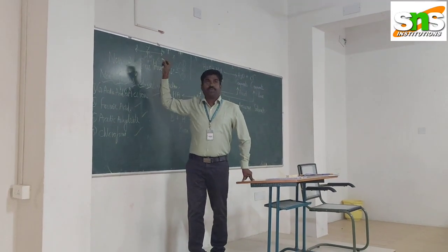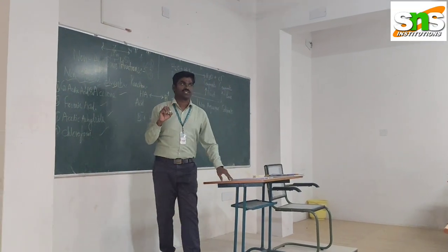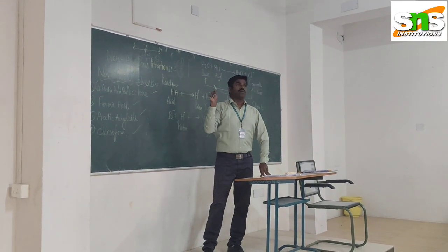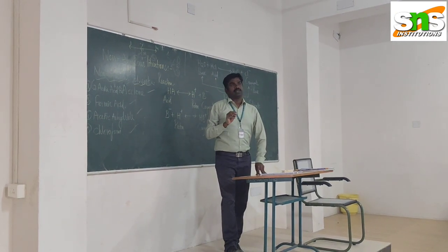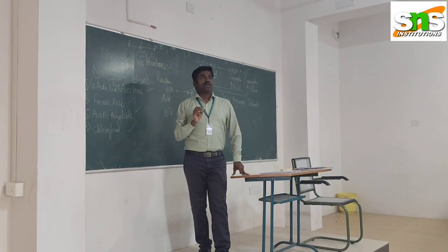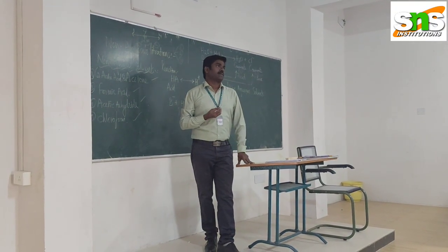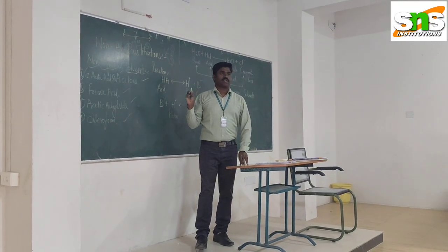So if the API or this drug has a weakly acidic or weakly basic pH range, like 6.5 to 7.5, we cannot use the normal solvent system. I mean, we cannot use water solvent system for such drugs. Such drugs will give better results in the non-aqueous titration method.